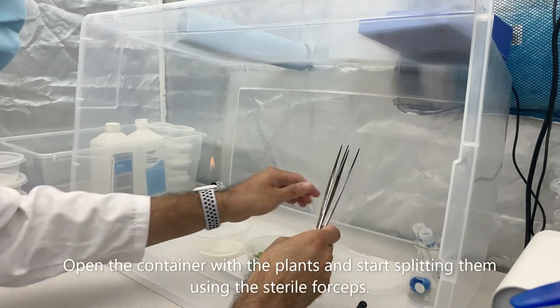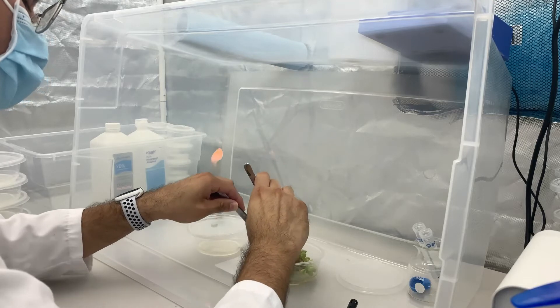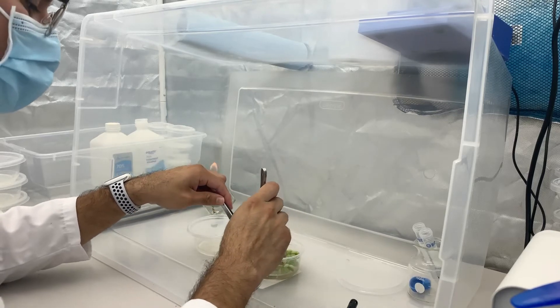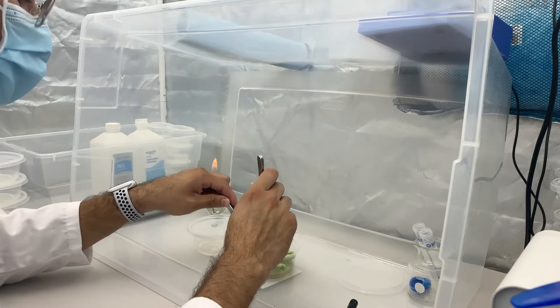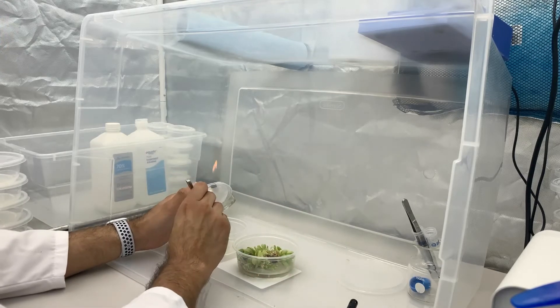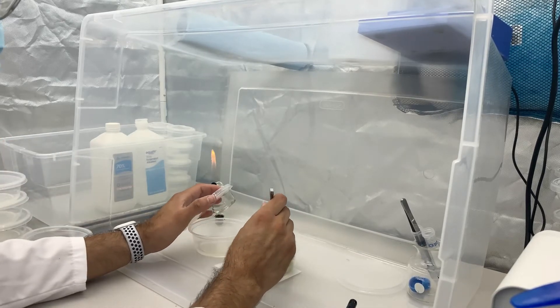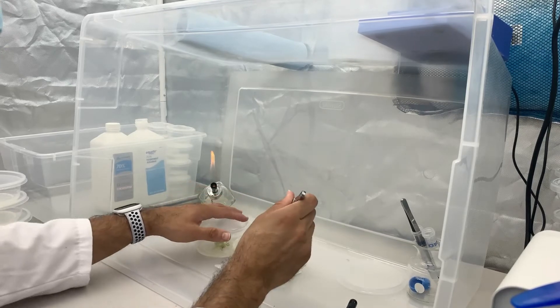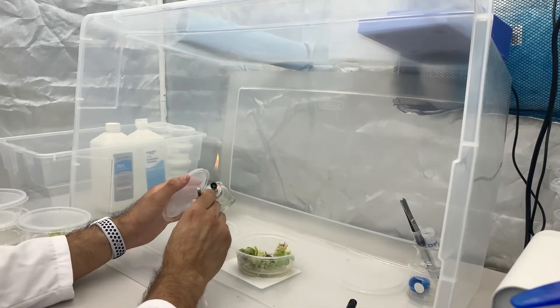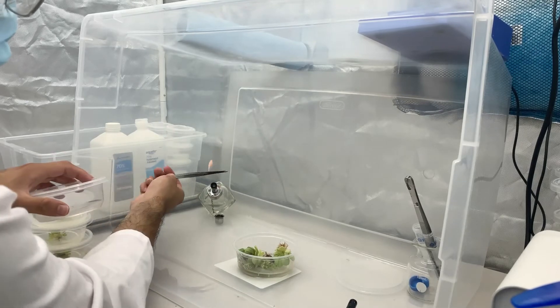Now's the fun part! Open the container with the plants and you can start splitting with the sterile forceps. Alternate the forceps in the 70% isopropyl alcohol every three to four containers.